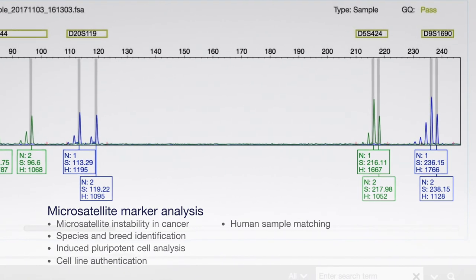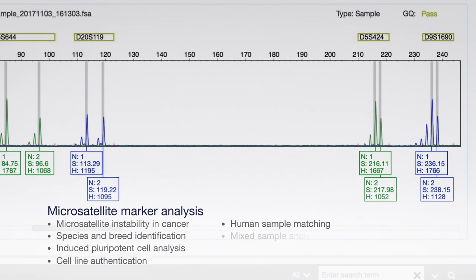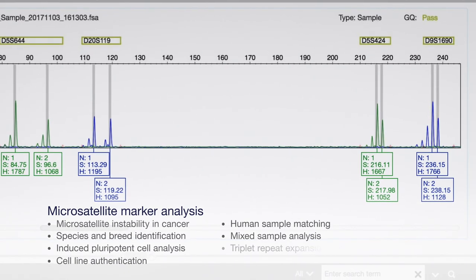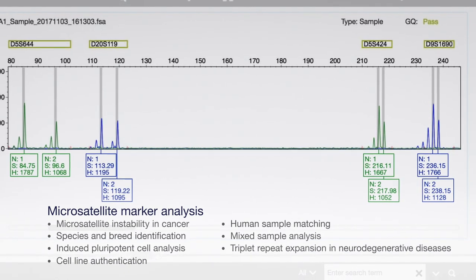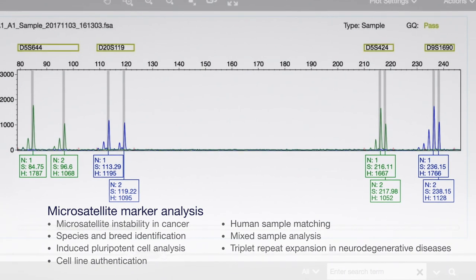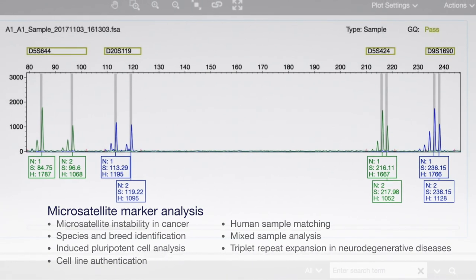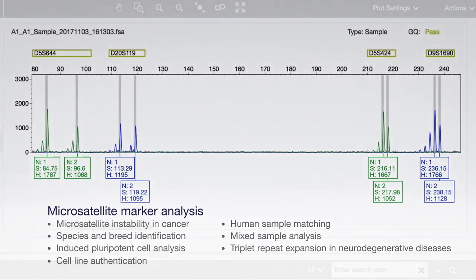Other applications include human sample matching, mixed sample analysis, and triplet repeat expansion in neurodegenerative diseases.